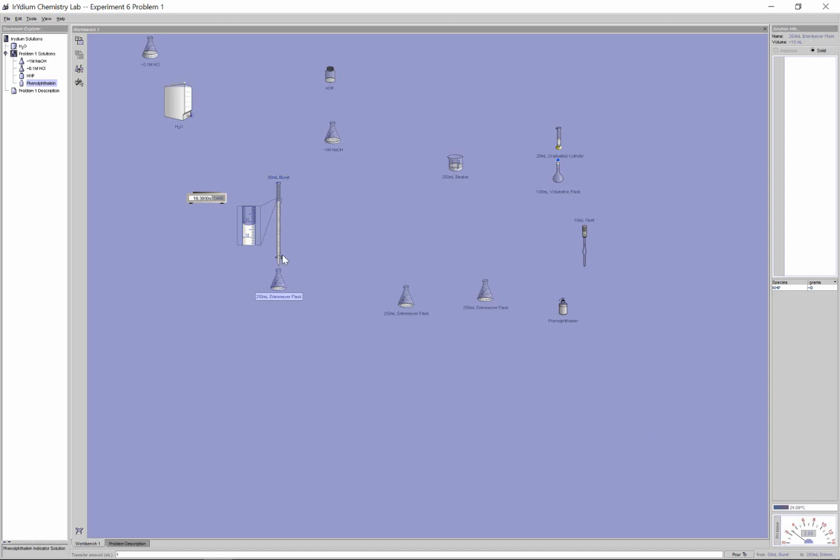There's a little stopcock valve at the bottom of the burette that you can slowly open and close. It's really fine-tuned so that you can drop in little droplets of solution as you need. So what I typed in here is I'm going to transfer in 1 ml at a time. I'm just going to keep pouring it in, and I'm going to keep waiting for the solution to turn pink. I don't want to overdo it. If I overshoot it, there's now an excess, and now I don't have a good count of how much acid there is. So I'm going to start from that 11.